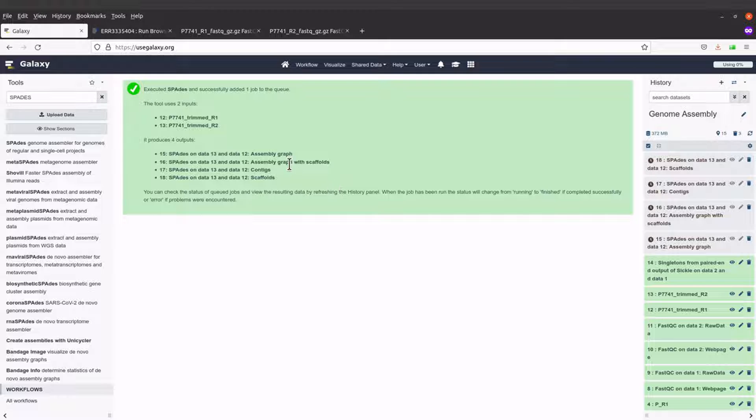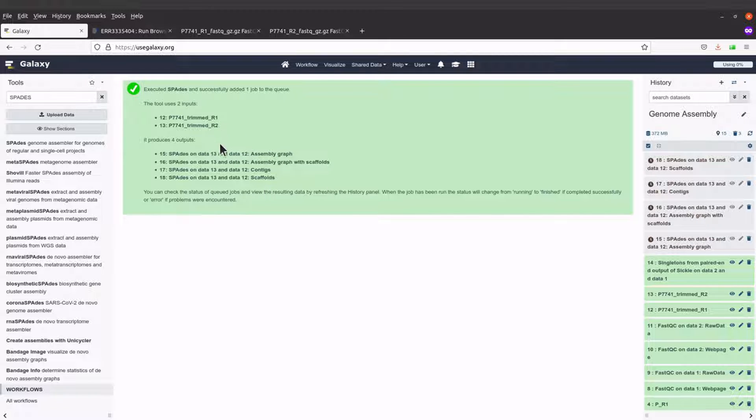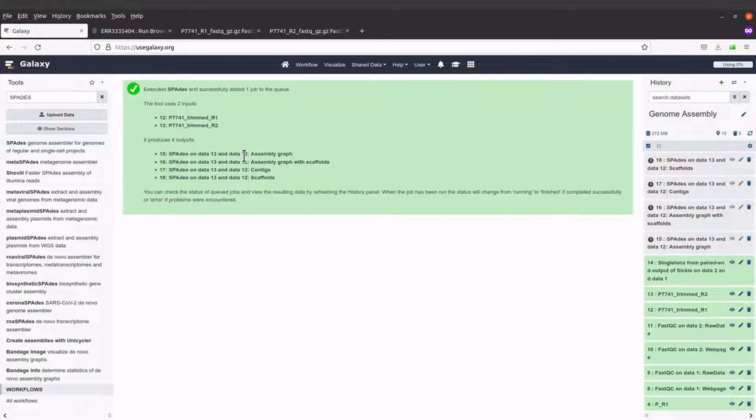These are the files that will be generated. The assembly graph can be visualized using tools like Bandage.